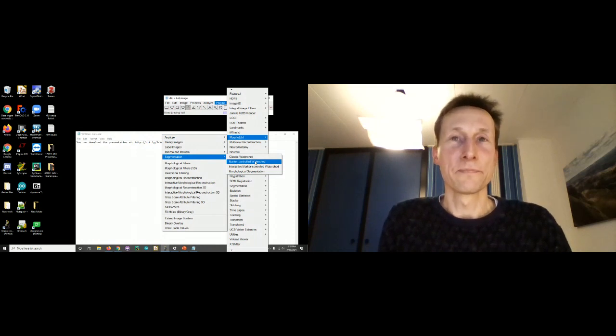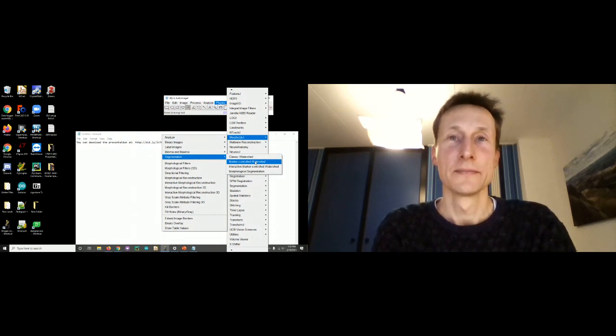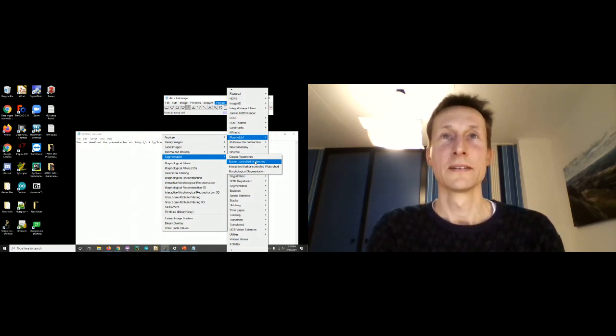Because you just put seed points in your first frame, as long as it's a binarized mask. The marker-controlled watershed, the way you think about it is like you're pouring your seed points down through your movie. And it will naturally segment, so even if you get a merger and a split, the marker-controlled watershed will actually segment the merger and the split for you. So this is such a good tool for tracking objects. I love it. It's so good.